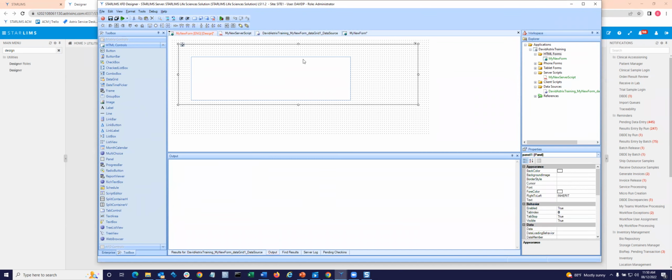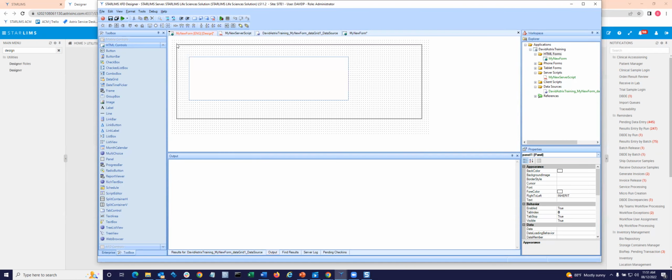So this is actually a good thing here. I loaded this panel on the form, and I loaded a data grid into the panel. So if I have a whole series of controls that I need to adjust somewhat, rather than going and adjusting every single one of the controls, just like any other standard UI in an IDE system, you can take this and move it around, and you can align your controls and give it the aesthetic qualities you want.